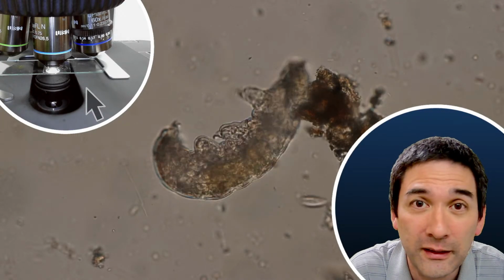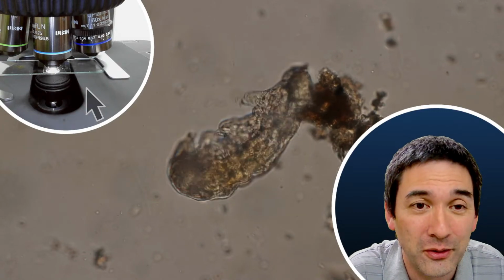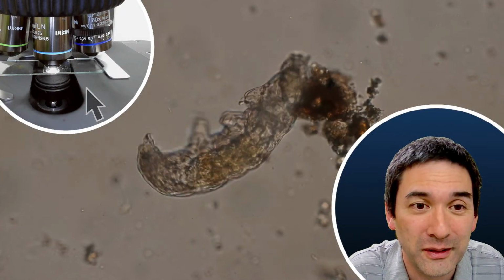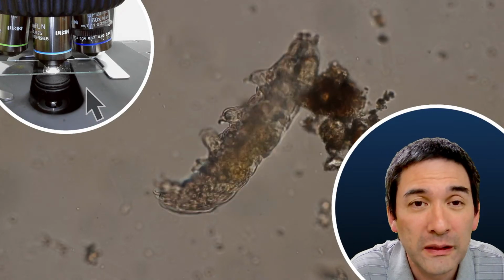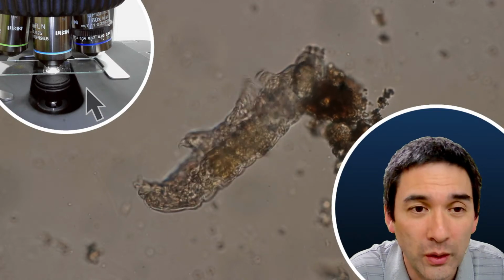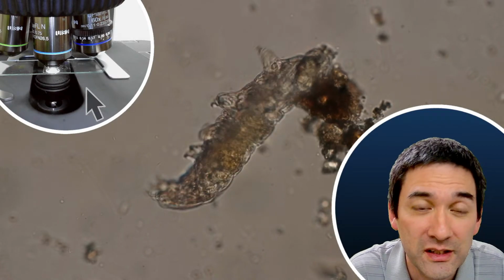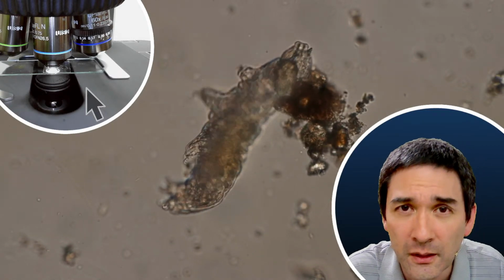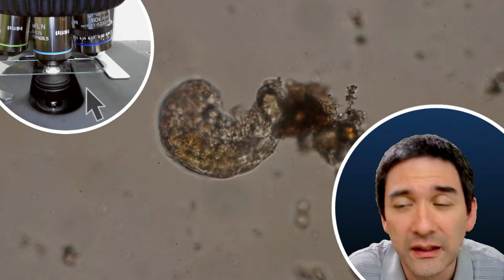He completely took it apart and got it back almost like new. That is possible, but completely taking apart a microscope is... I tried that once and I could not put it back together again. I'll be honest, the mechanical stage was so complicated that I would not risk it unless it's really necessary.